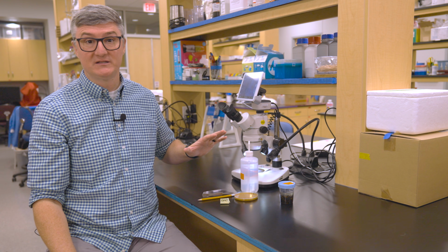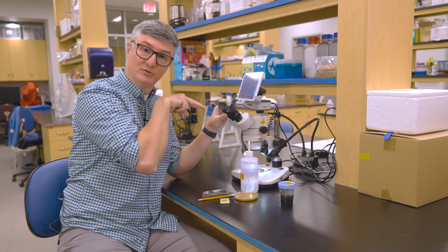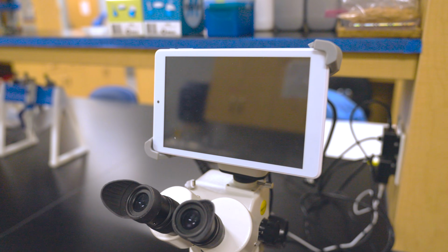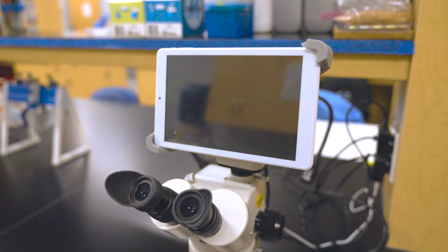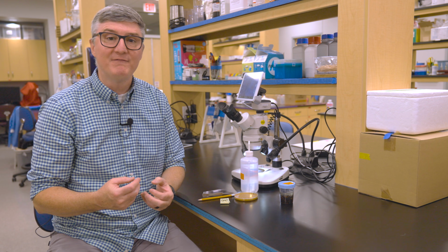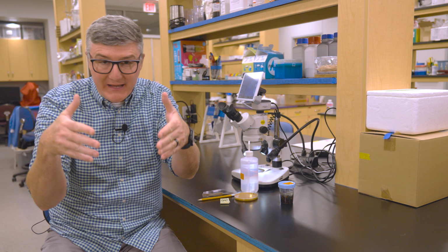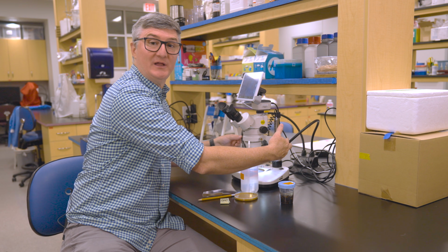A lot of the dissecting microscopes today have both the eyepieces that you can look through while you're doing the dissection, or they contain these digitized pads where you can do the dissection from here and see it on the screen, making it more easy to do. Also, dissecting microscopes have their own light source, but you really need to be able to see what you are doing when you are inside the bee. So I like to have this additional light source.